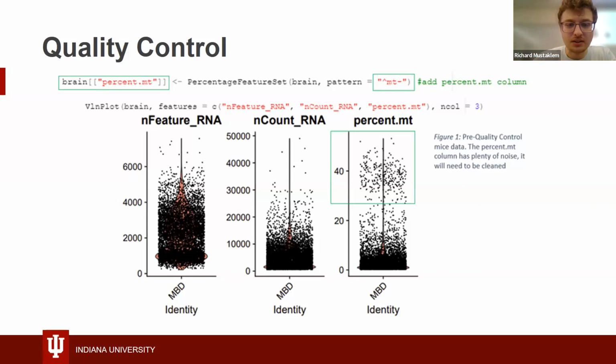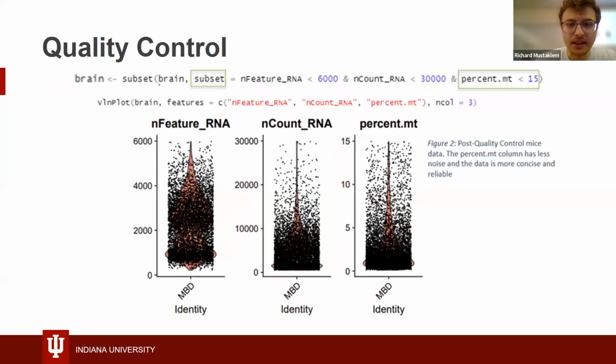And we can see that there's a clear double, there's a group that's doubled. It's this group that we want to clean first, because we know that this group is not correct. We have a weird abnormality here. We need to get rid of this, so we can adjust our code with this.